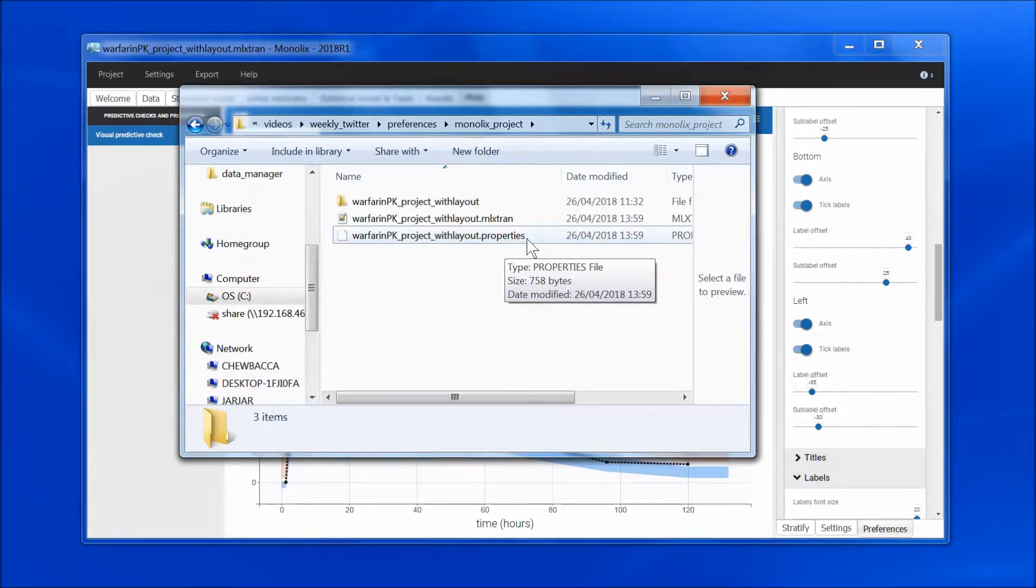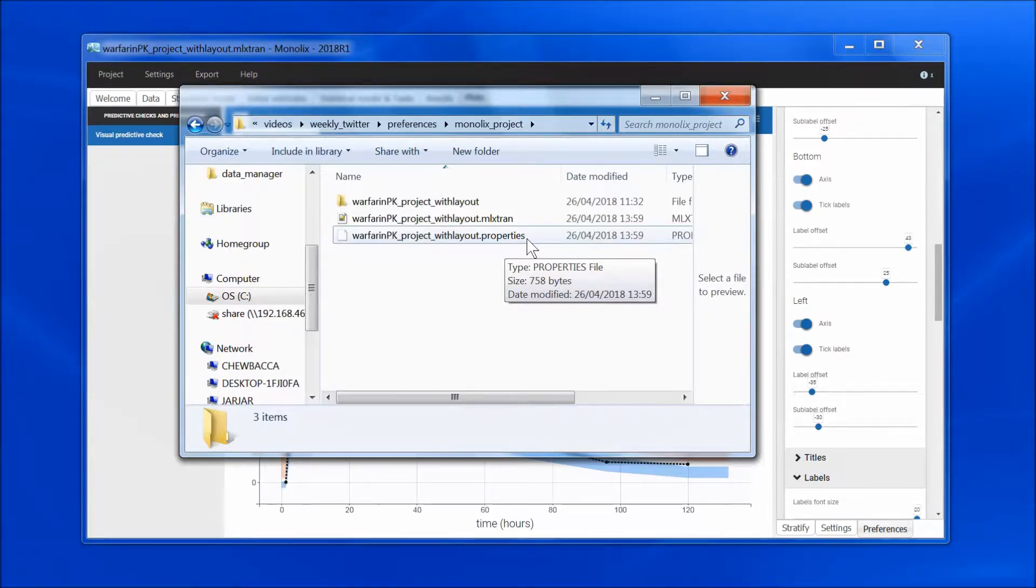If I reload the project and generate the graphics again, all preferences will be kept.